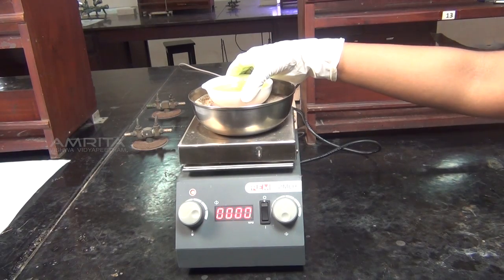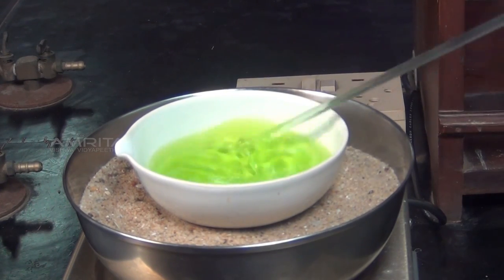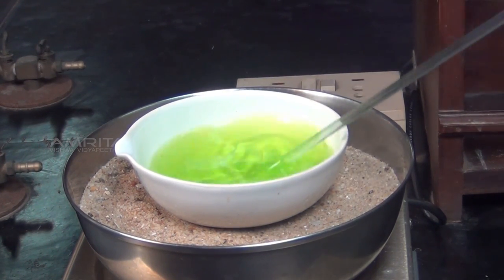Heat the solution in the china dish over the sand bath. To avoid crust formation on the side of the dish, stir the solution continuously with a glass rod.